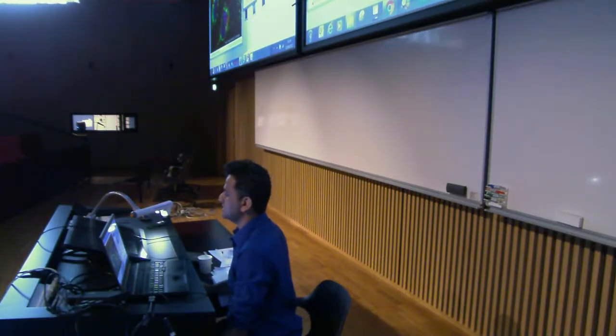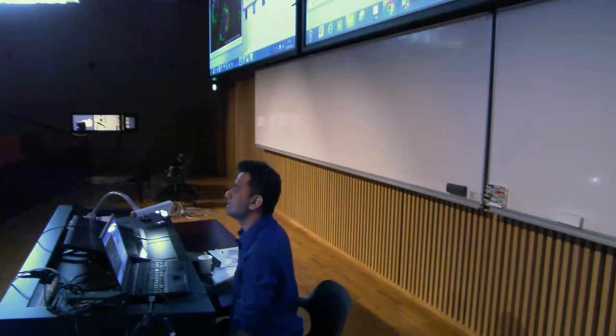You see what happens actually, because when you say, let's say, 550 and 1100, now I am changing just the visualization. When I set and apply, all the pixels from 550 to 1100 will be transformed to 0 to 255 if you change the type of this image to 8-bit.